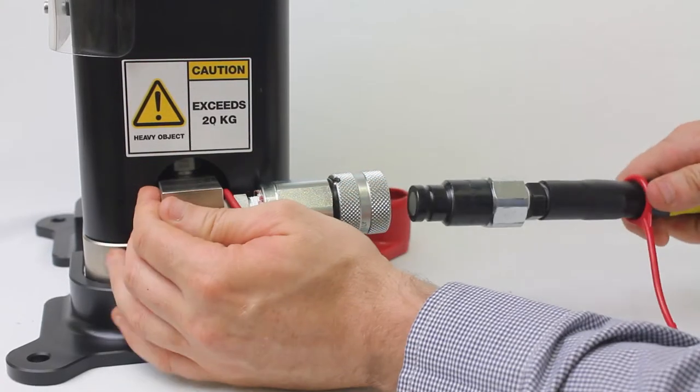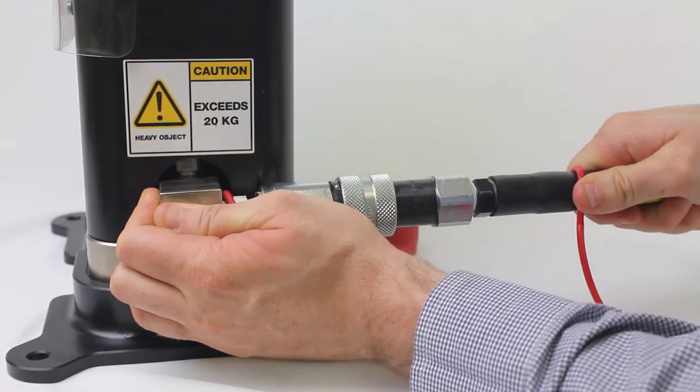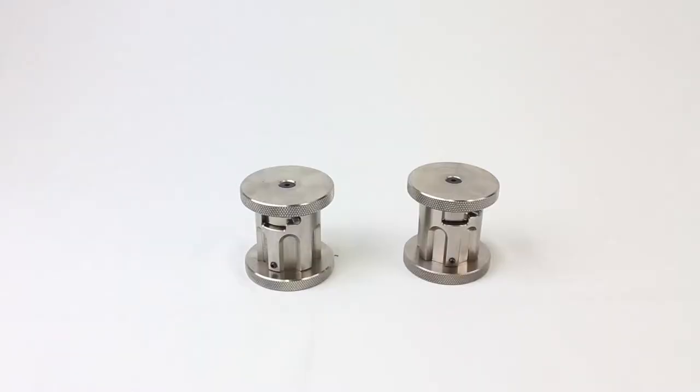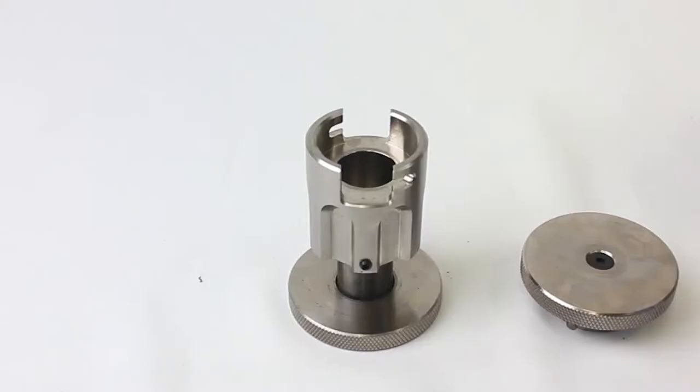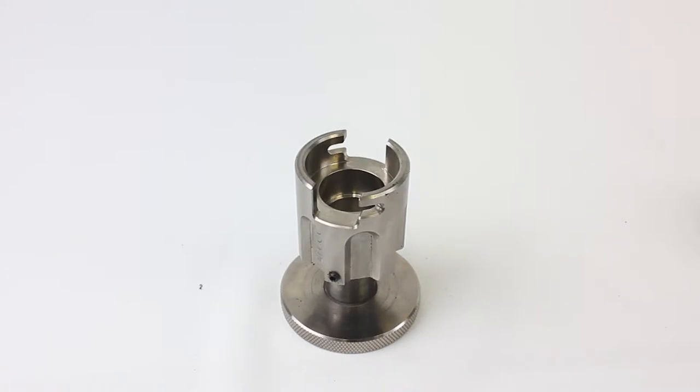The dies can be identified by removing the cap and observing the die body. The standard die will have a smooth cylinder, where the premium die will have a cutout to accommodate a plastic ring.